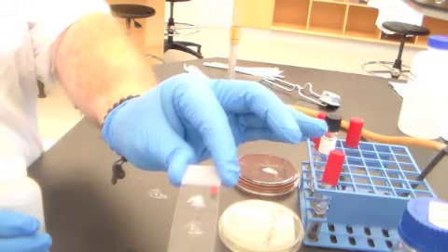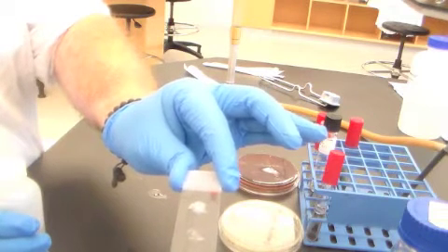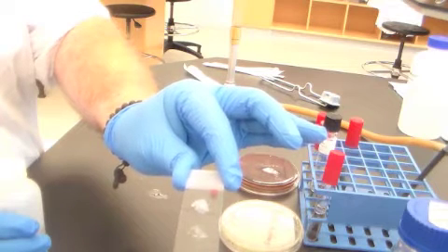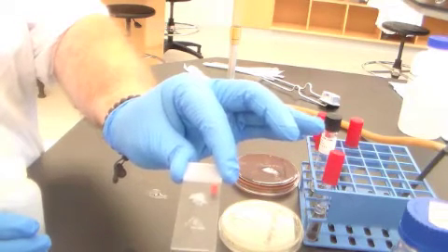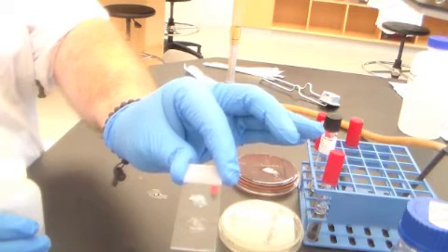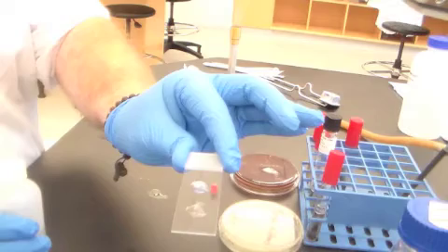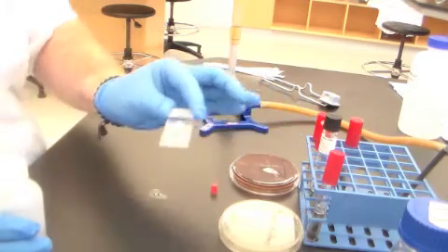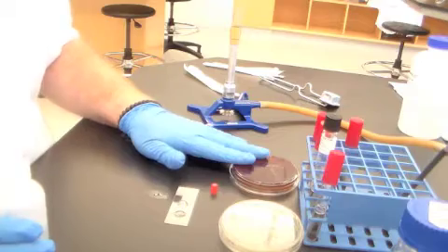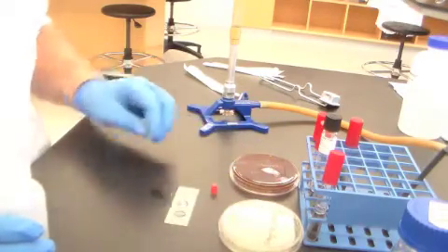What's happening here is that the catalase enzyme, which is obviously present in Staphylococcus aureus but not Streptococcus mutans, is breaking down the hydrogen peroxide into water and oxygen. So the bubbles that are being given off are oxygen gas. So this is evidence of the fact that the Staphylococcus produces catalase, Streptococcus doesn't.